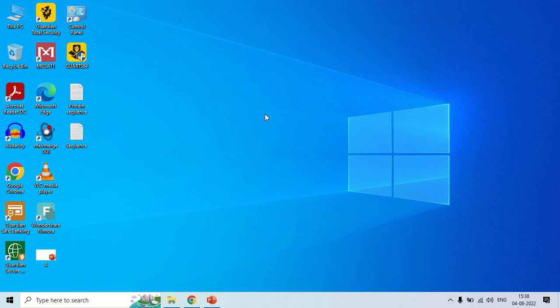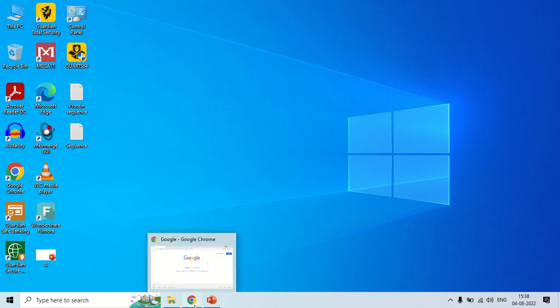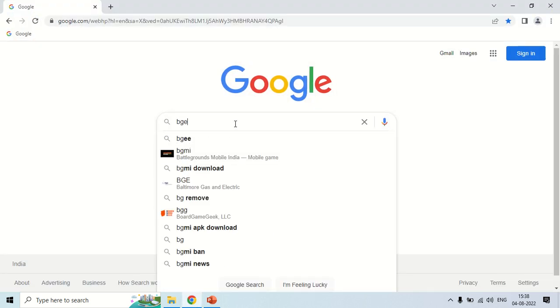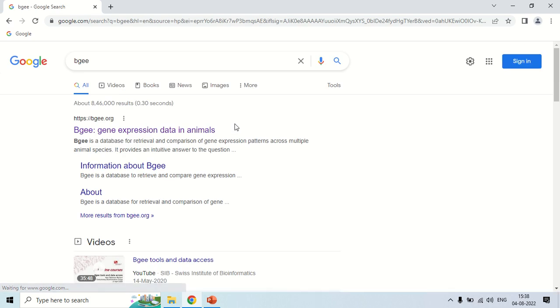Hello guys. In this video I will talk about the BGE software which is used for analyzing gene expression and also for the comparison of gene expression. To access the BGE software, open the browser and search for BGE — the name of the software — and here the first result is BG.org, click here.